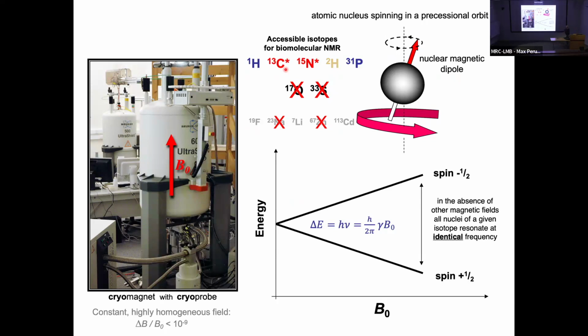Okay. The other nucleus that's up there, strictly speaking, is not a spin-half nucleus. It's deuterium. It's not used for bringing nuclei into play. It's used to substitute out hydrogen, the protium form of hydrogen, so that we silence particular areas of the molecule by putting in deuterium in its place.